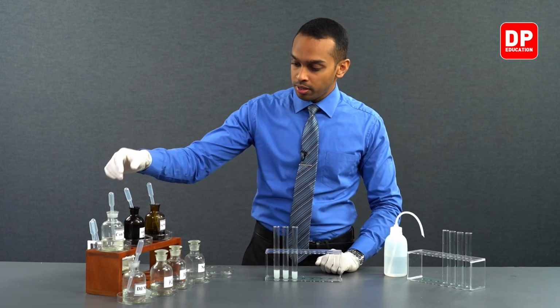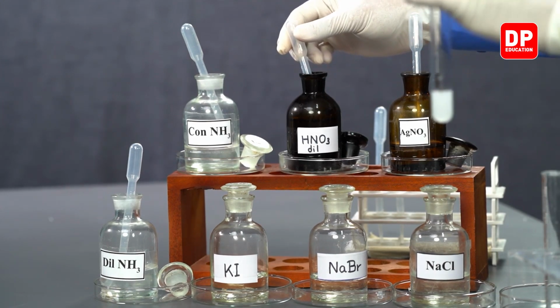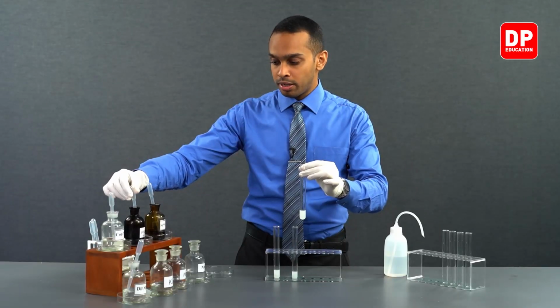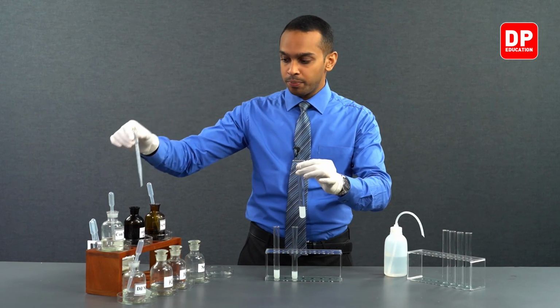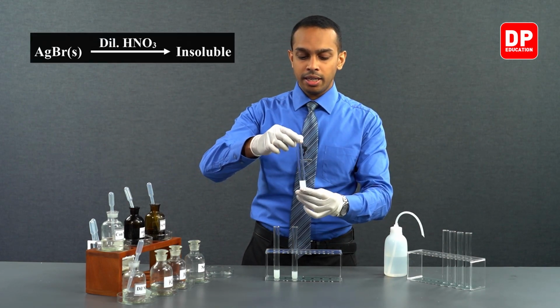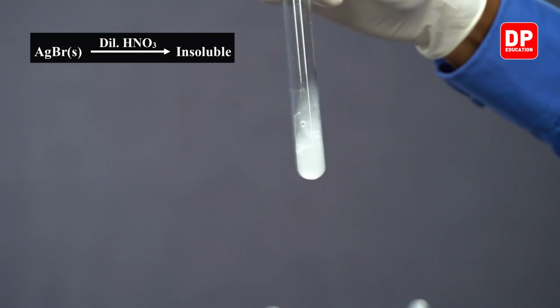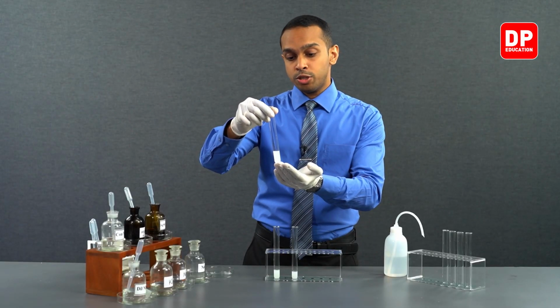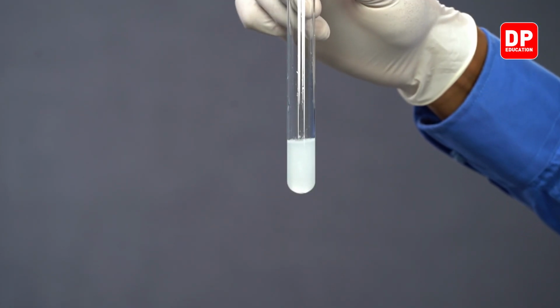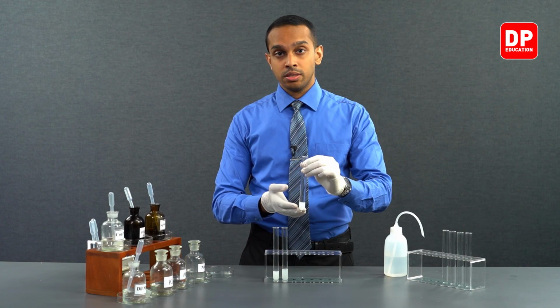So, first of all, we'll take a little bit of dilute nitric acid, and we'll take silver bromide suspension, and we will add dilute nitric acid to see if there will be any observable change in the medium. As you can see, adding dilute nitric acid did not bring about any change. This is because dilute nitric acid is not capable of dissolving silver bromide solid. We would be moving on to adding a little bit of ammonia onto this.